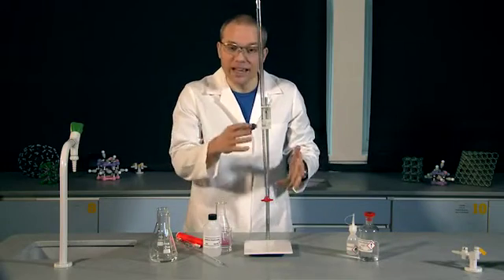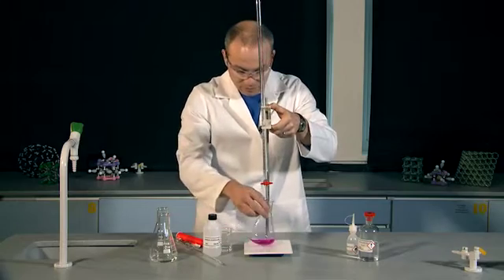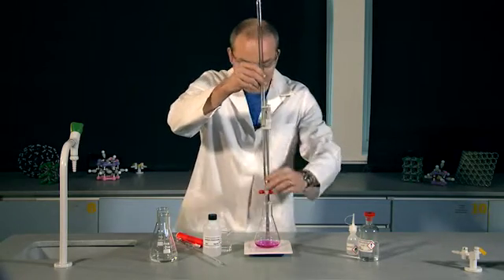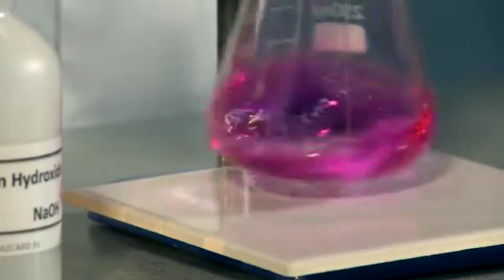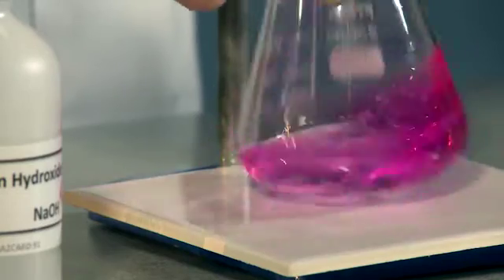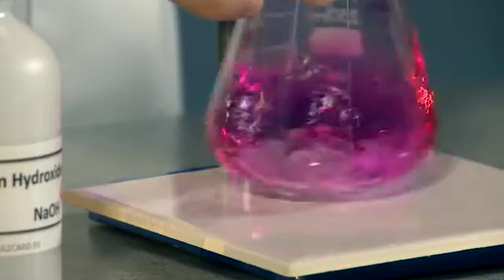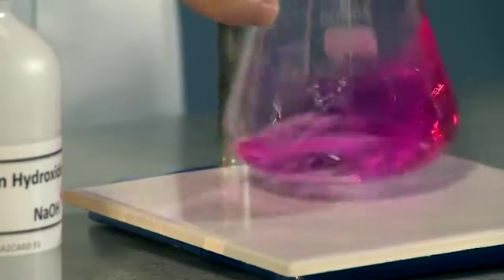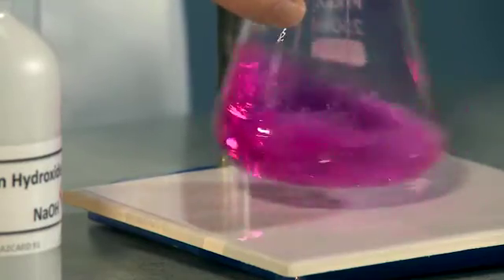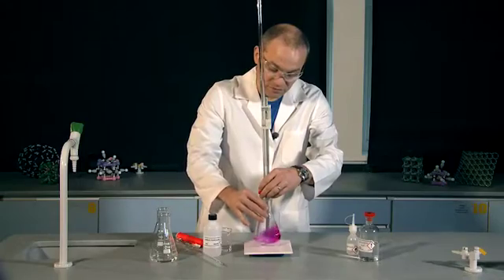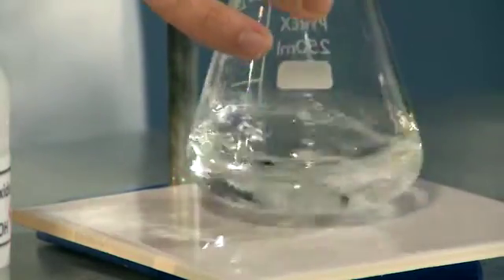All I need to do now is add my acid to my alkali. It's really important to swirl your mixture to ensure that the acid and the alkali react and mix thoroughly. All I'm looking for now is for the colour change, pink to colourless. And as soon as I see it, I need to close the tap. There it is.